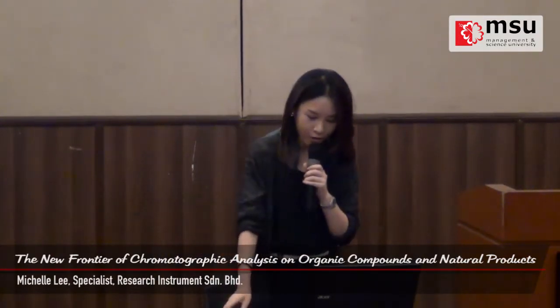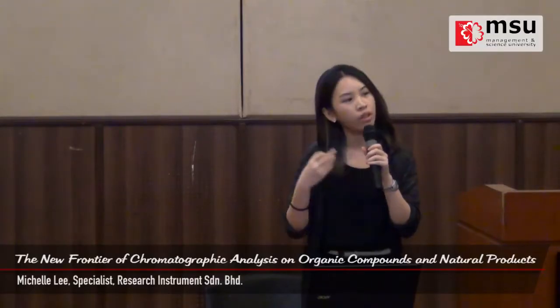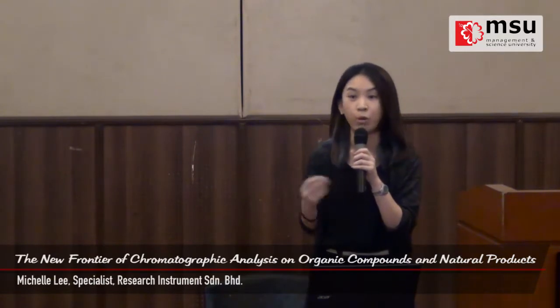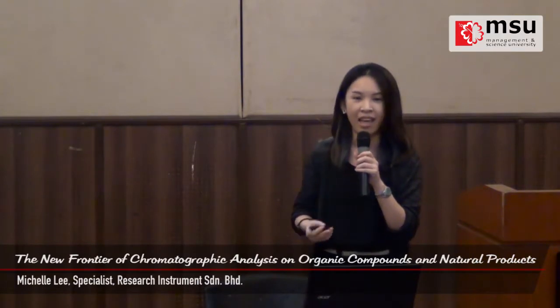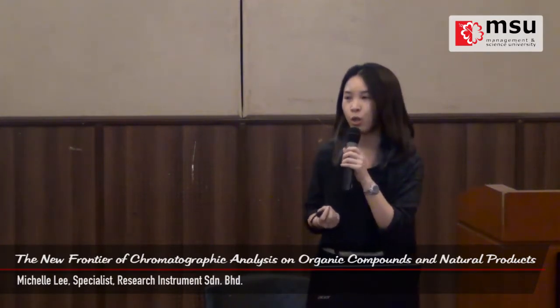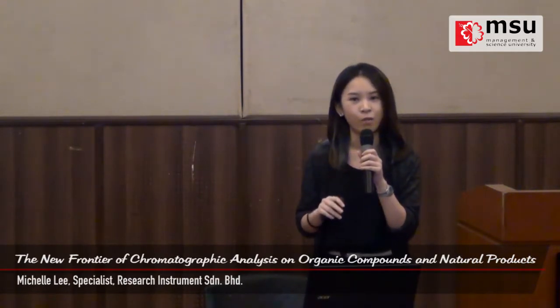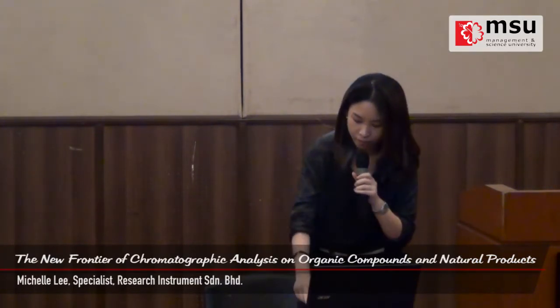Okay, so for today, my topic is mainly about thin layer chromatography techniques. Most people might still think that thin layer chromatography is a very manual technique, and that it needs a lot of tedious sample preparation, and at the end of the day, the result might not be very reproducible and it is very difficult to do documentation. So today I am going to share with you how people actually do TLC with current technology, which is using instrumentation. Alright?